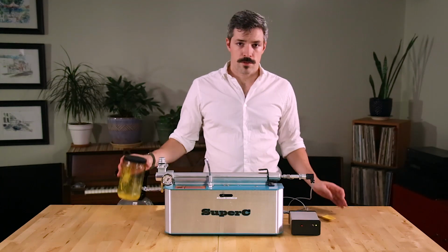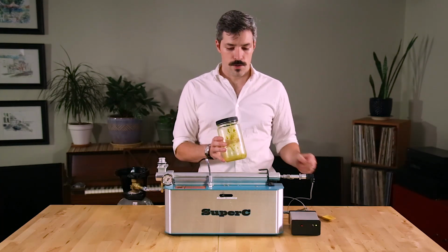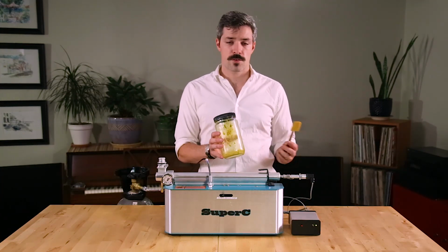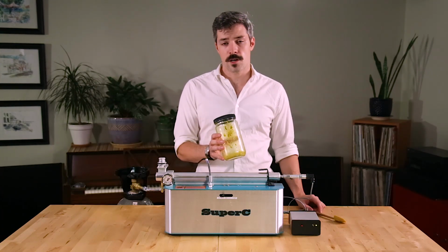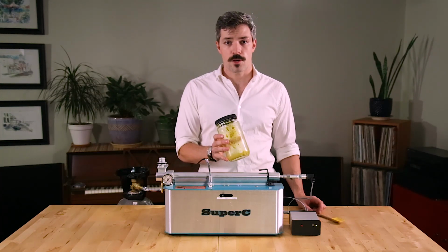Now that our system is depressurized, we can begin recovering the extract from our collection vessel. If you're using a material like hops, which has a thick resinous output, I recommend scraping the jar with something like a thin-edged silicone spatula. If you're doing a light fraction extraction on compounds such as terpenes, you should be able to pour that material or use a pipette to remove it from the jar.